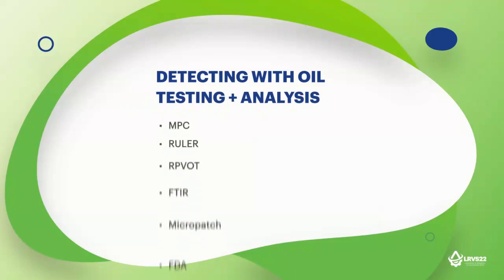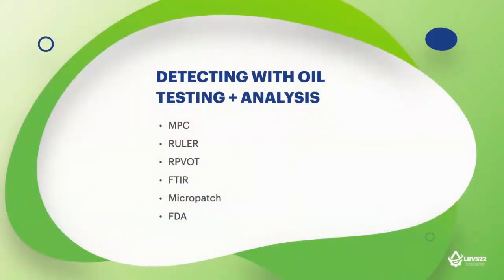So now we're going to talk about testing for varnish, the various different types of test methods that are out there. The traditional one has always been MPC, membrane patch colorimetry. This test detects insoluble varnish in the system once it's plated out. RULER analysis will check for antioxidant level depletion, primarily focusing on two different types of antioxidants: amines and phenols. A lot of turbine oil formulations will contain both or might have predominantly one over the other. Then we have RPVOT.